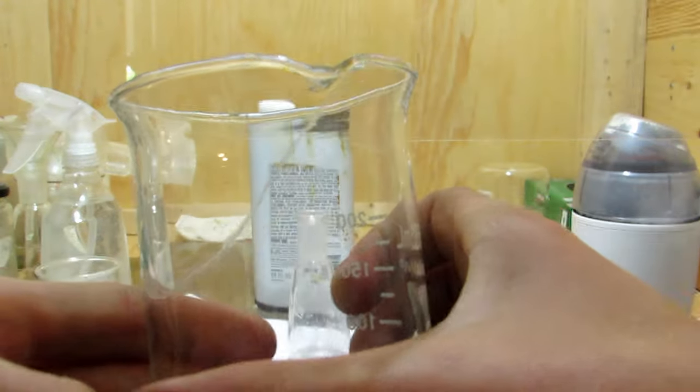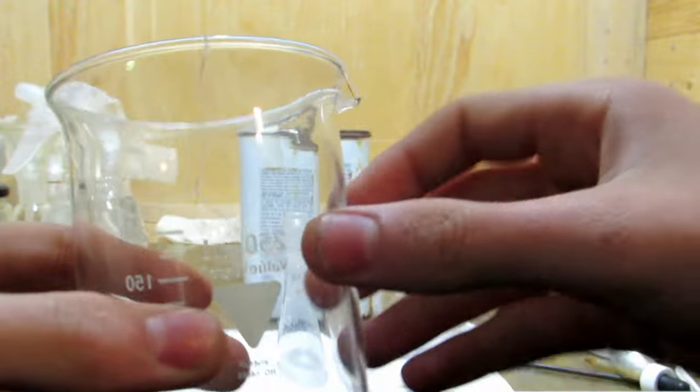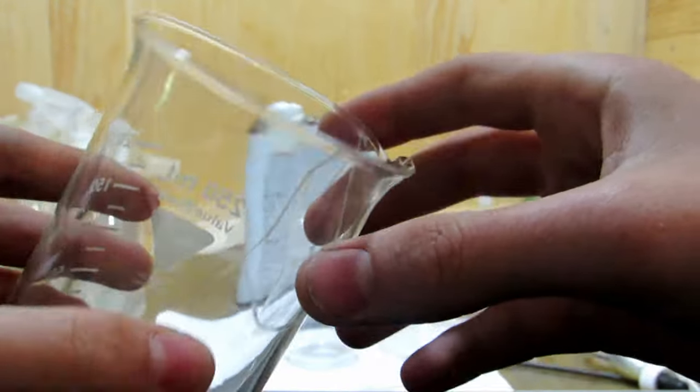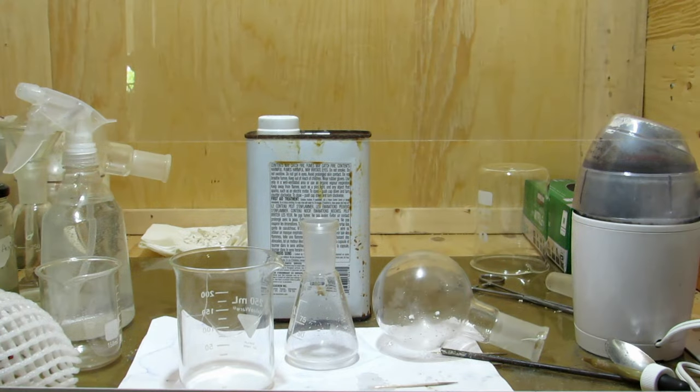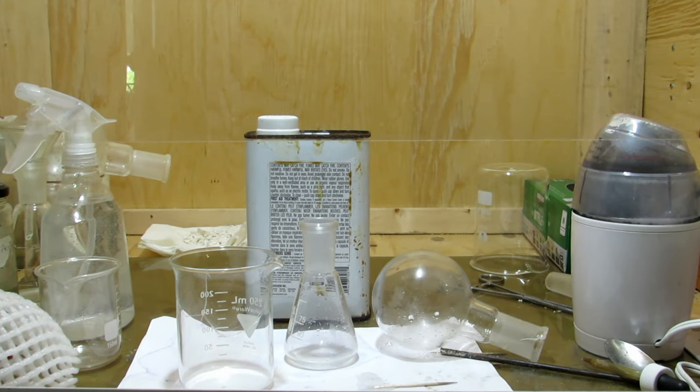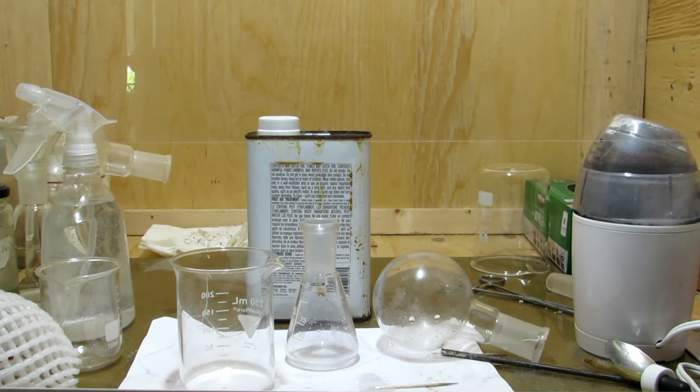And finally, the beaker, which looks relatively good. This can be used for most liquids. So there's basically how to fix old glassware so that you don't end up throwing it out, because that is a huge waste. Yeah, hopefully you guys can do this instead of throwing out your glassware, and hope you guys enjoyed. Wait, bye.